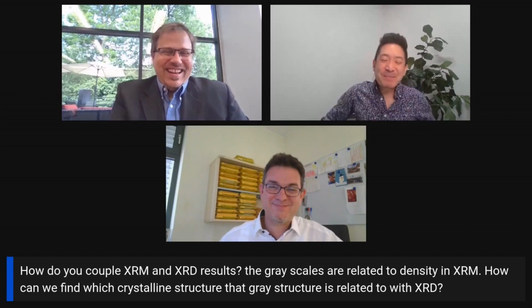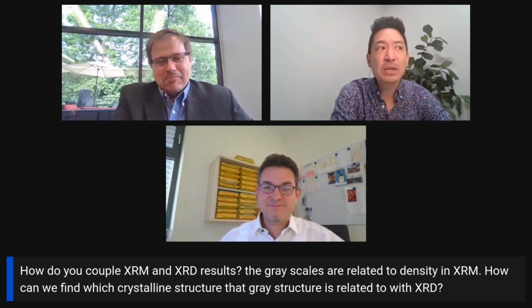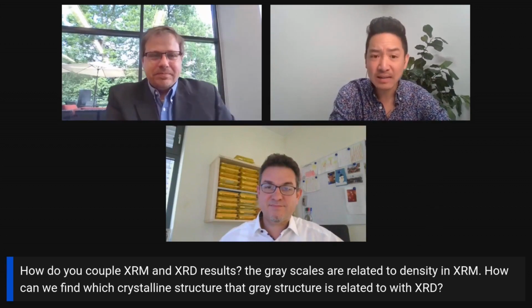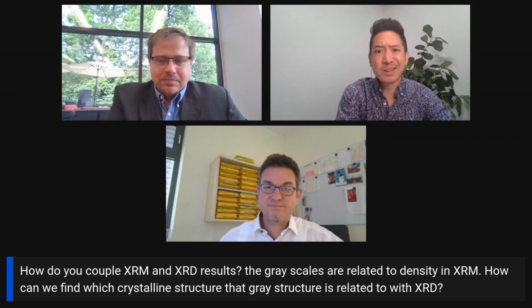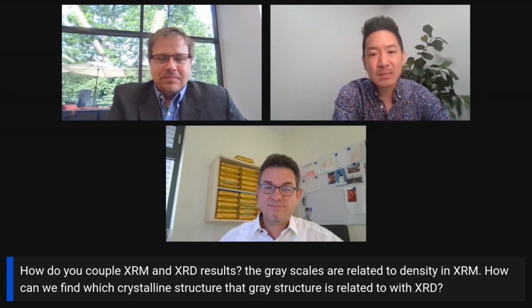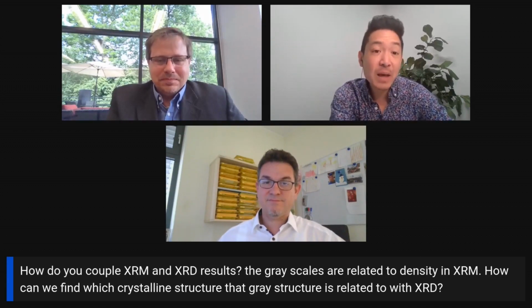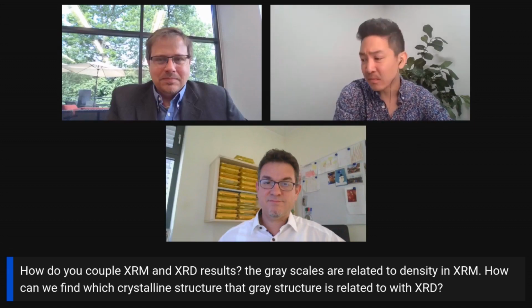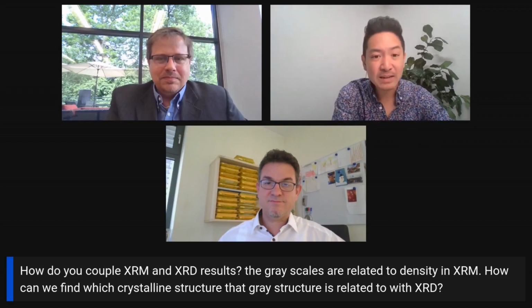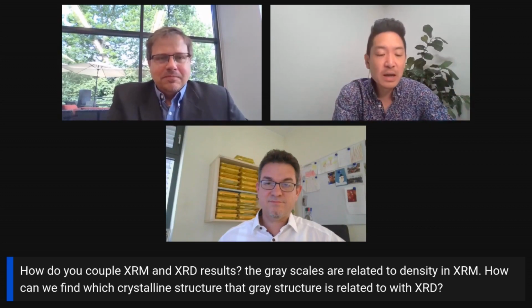All right. So typically, I find that it's not fully forensic. It's not fully diagnostic, right? I would never take a material and just say, I don't know anything about it. With microscopy, you can get things like maybe the more dense particles happen to be your API. Maybe there's a metal center there, or maybe it's more granular or more compacted, so that you have the excipients that are going to be fluffier, and you would know that.